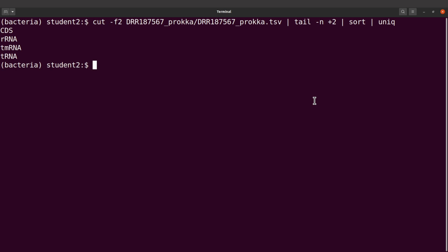All right. So this is what we have for the features. Okay. So yeah, for the data we have here, there are no genes. I would have expected to see genes also here. We have CDS, we should have genes, but that's what we have anyway. Maybe the data is downsampled, or I'm not really sure, but that's what I have, by the way. So I'll just go with it. So it's a practice data, but if you are dealing with whole genome sequence for bacteria, organisms, or bacterial isolates, then you should expect that Prokka also gives you features that are genes. So take note of that.